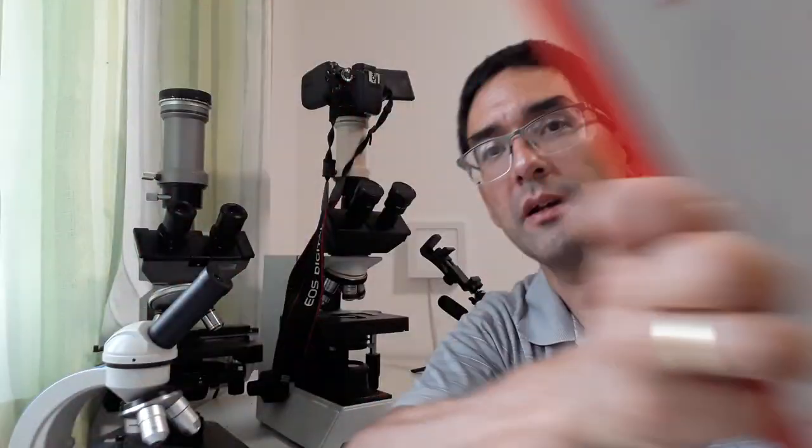Very high-end microscopes, basically all the manufacturers they all switched over to infinity simply because it gives the manufacturers more flexibility concerning the microscope design. Sorry about this to adjust the exposure a little bit.